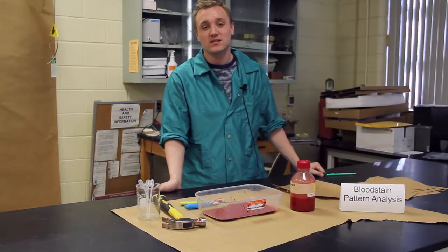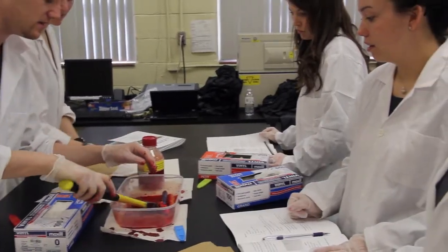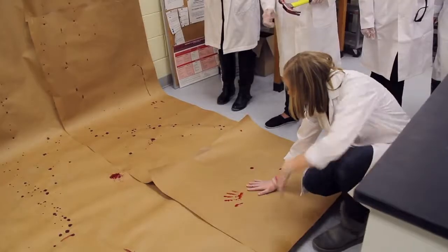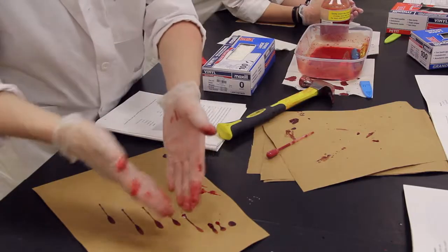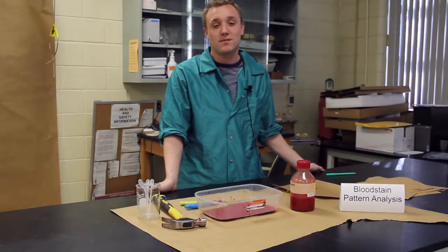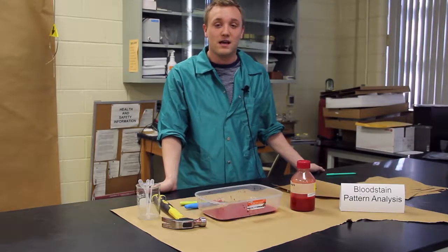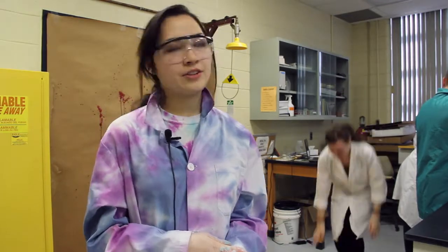We're trying to actually give the students an idea of what a blood stain analyst will do at a crime scene. So we've reconstructed some paper, and we are letting the students make different types of blood stain patterns on the paper and analyze them. Using different weapons like hammers and knives and just looking at the pattern they cast and seeing which direction the blood goes. It's been a lot of fun. You get a little dirty, but it's kind of interesting actually.